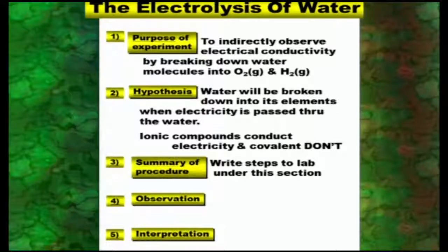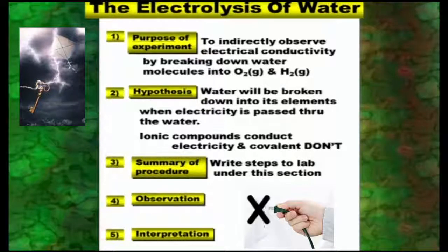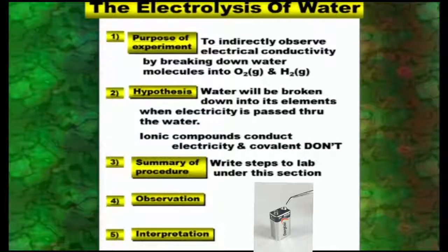First of all, we look at the word electrolysis. Electro means electricity. We're going to be using electricity. No, we're not taking it from the wall socket. Instead, we're going to be using a 9-volt battery. Not enough current there to cause you any damage.